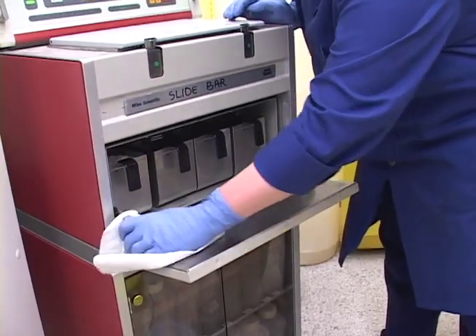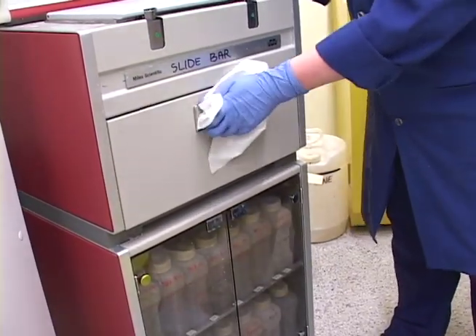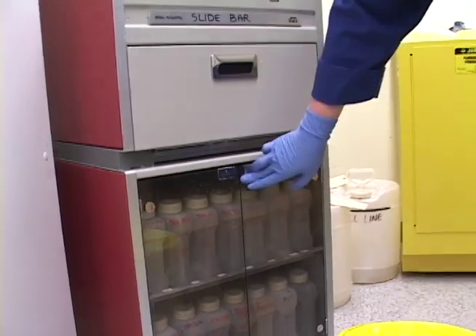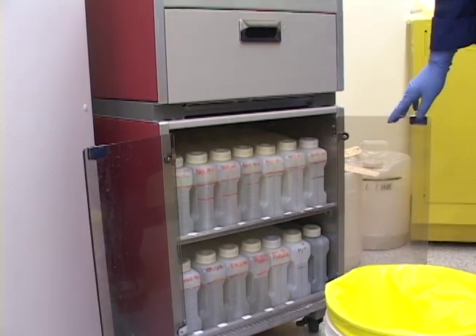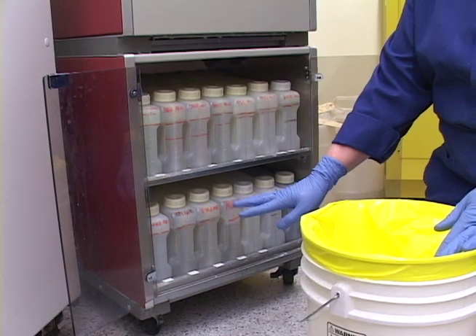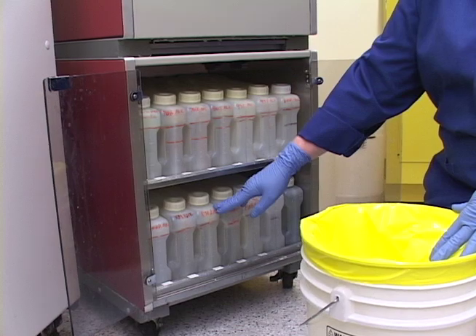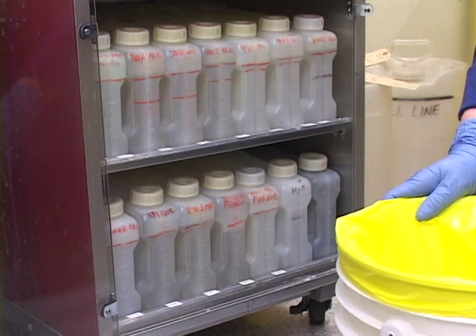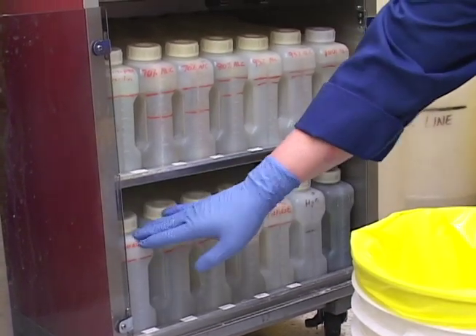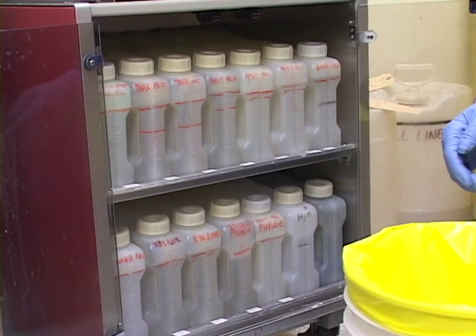I actually like to use gauze on this. Now the second thing I do is deal with the xylene. The xylene is used for clearing — it's the intermediate point between the 100% alcohol and the paraffin. The paraffin can't infiltrate if it doesn't go through the xylene first, and the xylene cannot be mixed with anything that has water in it. That's why the stations before it are 100% alcohol.